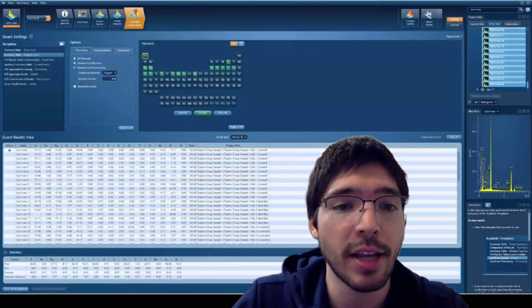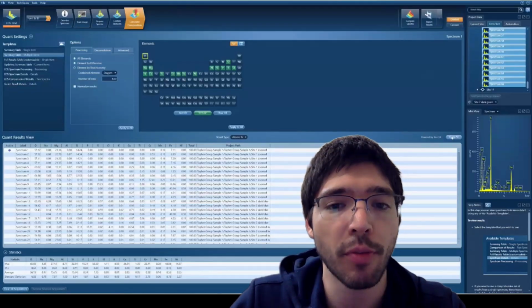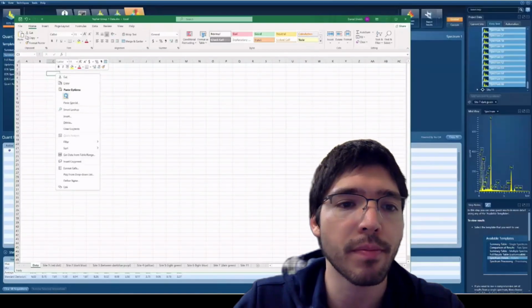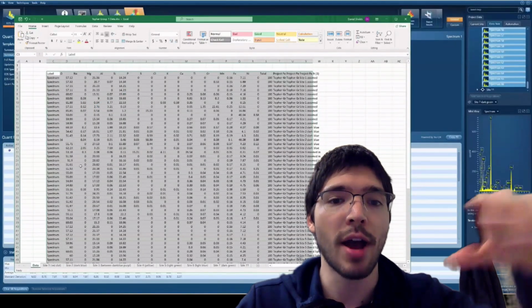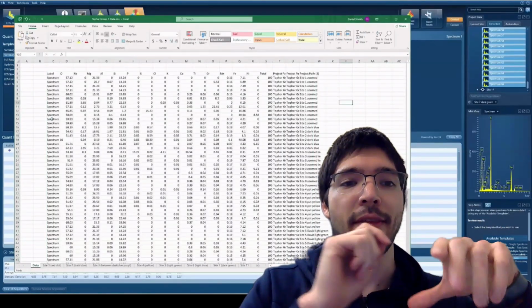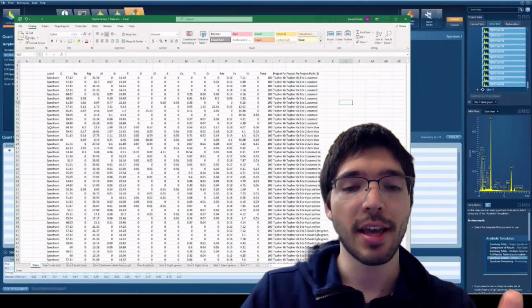And the other thing that is pretty cool about using EDS is it's much faster. With traditional microprobe techniques, you essentially have to wait about 4 minutes per point. You have to navigate the stage, move the sample into the crosshairs, and then sit there waiting for 4 to 5 minutes while it collects data from one spot.